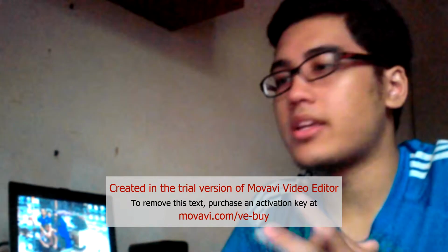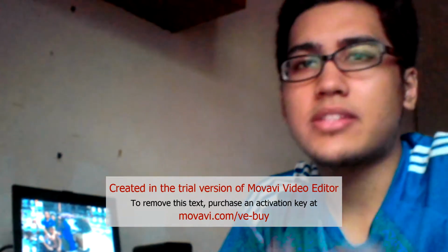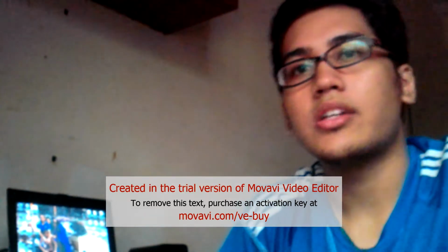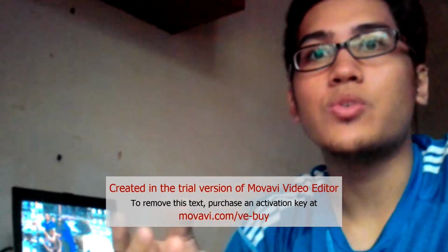So next will be the light application. For the light application, we use the emitting fiber optic light guides, and this sort of light can be used as an individual light management, and to utilize small diameter tubes which are being used in the production in order to optimize the algae growth. And for information, using this sort of light, it produces light, but it's not going to generate any electricity, so it can be used in a wet environment.